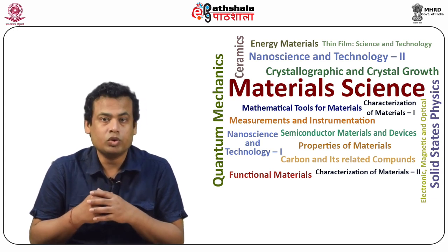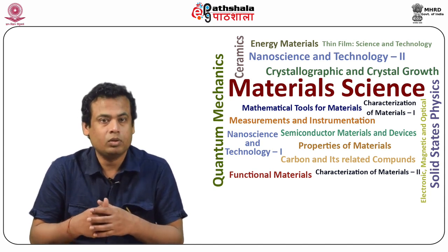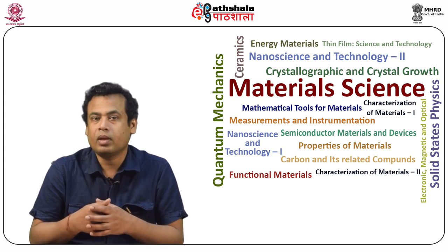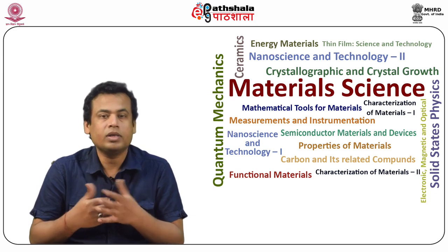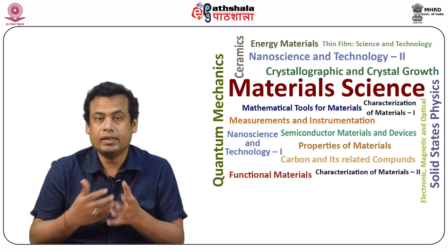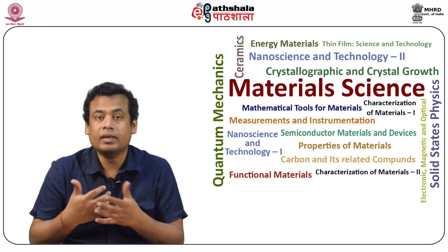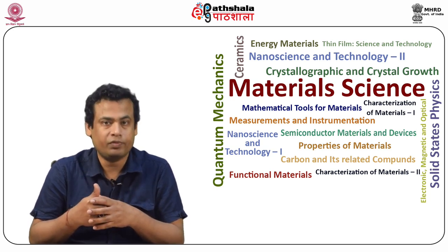The electron source in the microscope generates a beam of coherent electron waves, which when they fall on the surface of the specimen, interact with the atoms of the specimen and can form beams consisting of either coherent or incoherent scattered electrons. The electron beam generated from the thermionic electron gun passes through the electromagnetic lenses and is directed towards the column of the microscope and falls onto the sample surface.